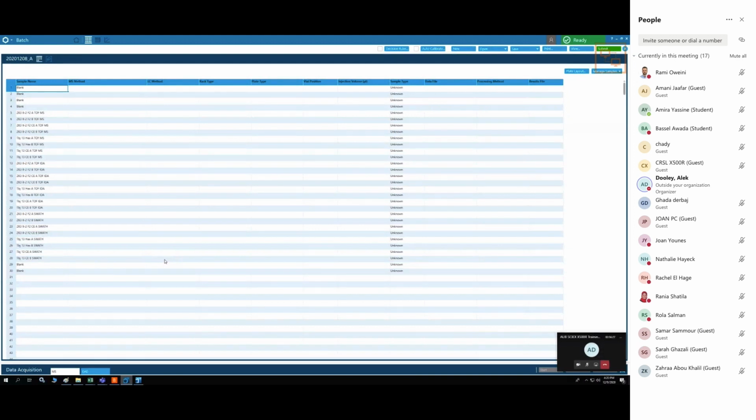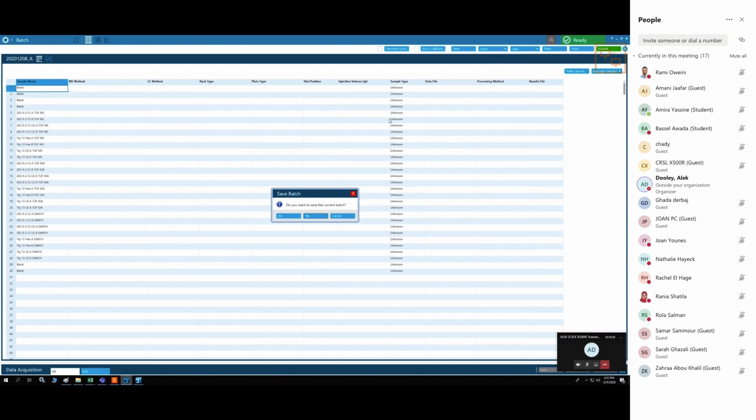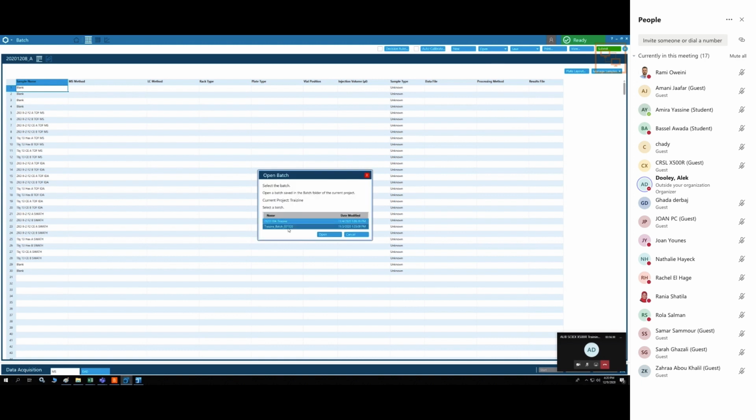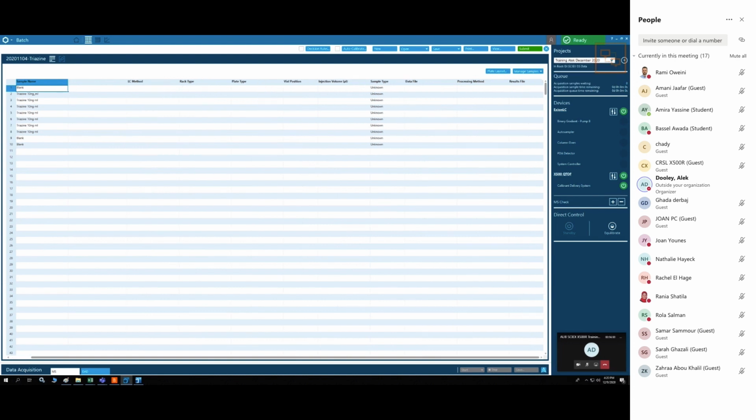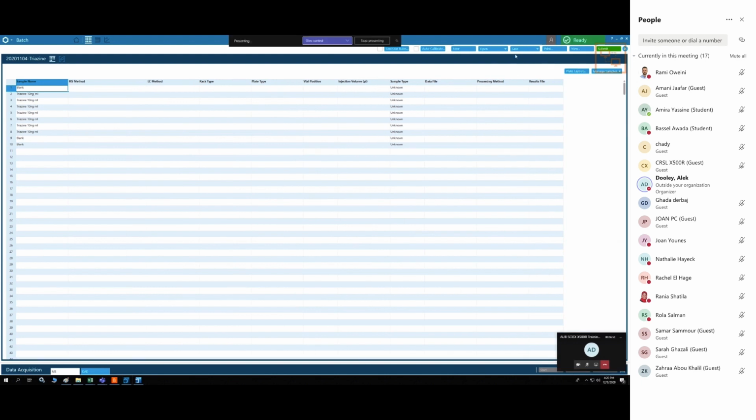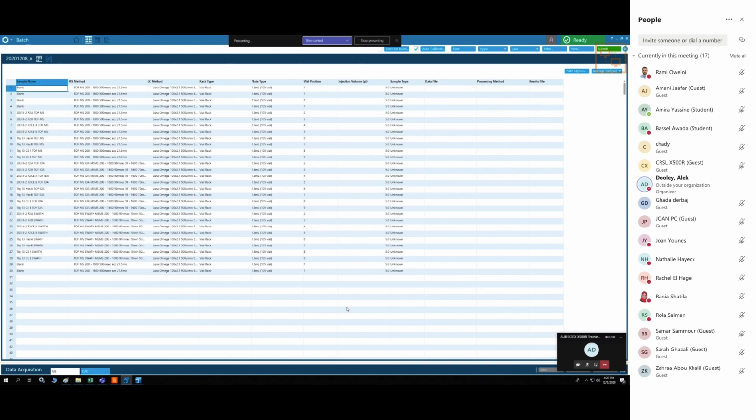So I'll talk about what I'll do in the batch. I will open now the batch that we saved yesterday. Oh, am I in the wrong project? Probably I'm in the wrong project, so I'll go to training project. So you see that things are not visible in another project, right? You saw already I made that mistake a couple times today. No, we don't want to save. So there's the batch. All right, so we have the batch here. This is the batch that we had yesterday.